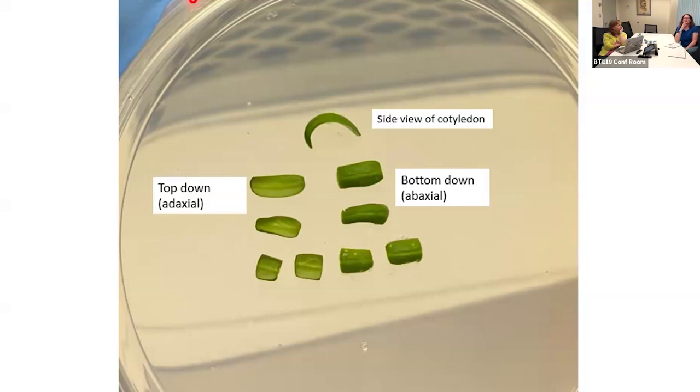We have found that although fruit can come from the same plant, one packet has terrible germination and the other has fantastic germination. Because you're so reliant on even germination for your transformation, the extraction is important. Don't take that part lightly. If your seed are not germinating like you expect, it could just be they weren't extracted well.